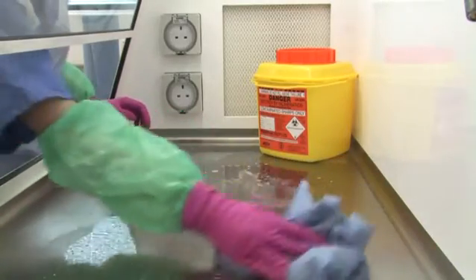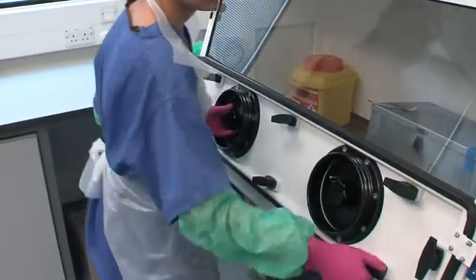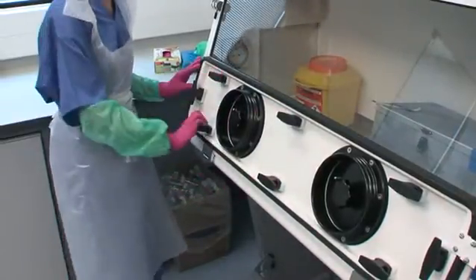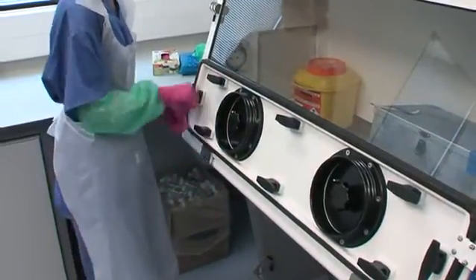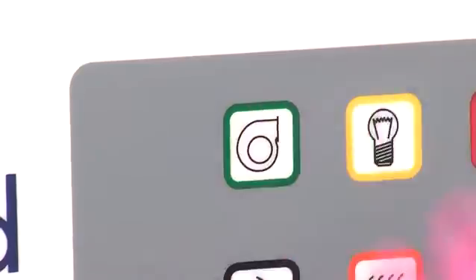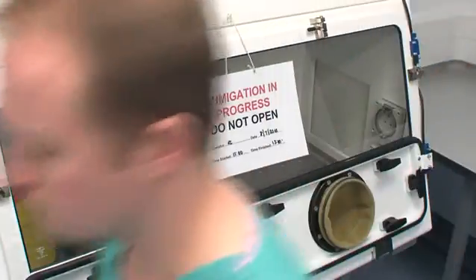When the clean-up procedure is complete and the cabinet is shut down, it should be given a final visual check to make sure that the door is secure. Any equipment or matter left in the cabinet should be fumigated in the cabinet. Once the cabinet has been cleaned, decontaminated and shut down, signage should be put in place to indicate the status of the cabinet.